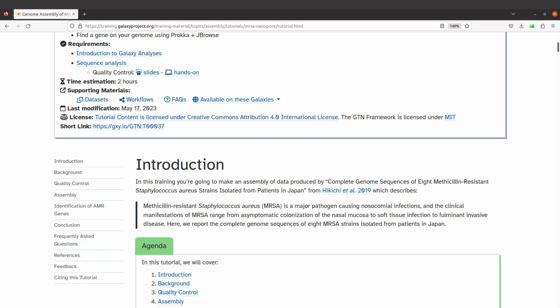And so one approach that is used to study antimicrobial resistant genes is through genome sequencing. And so after generating your data, you now have to use these computational tools to derive insights and then tell your story. And this is where this tutorial comes in handy.